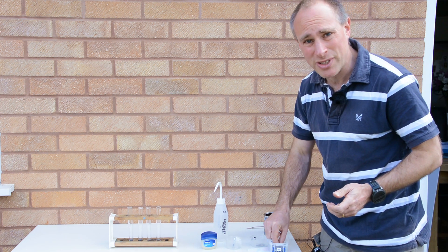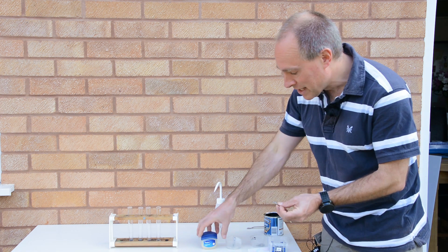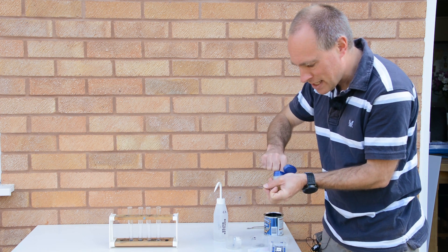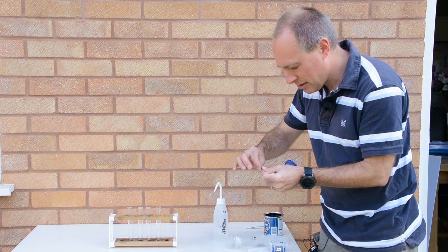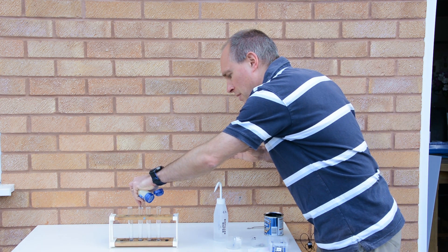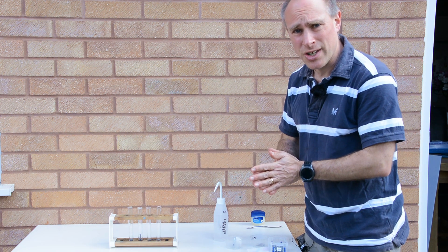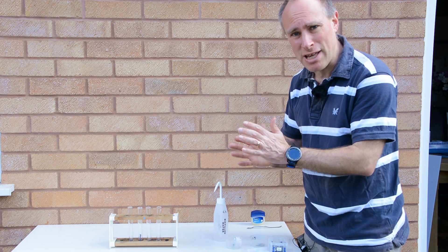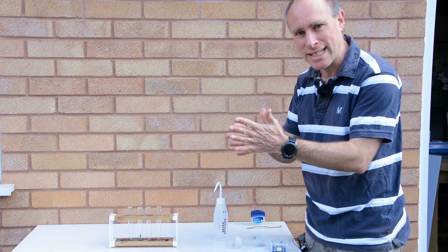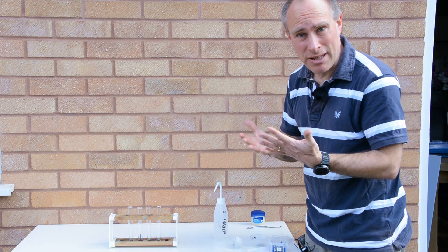The second method I'm going to look at is just coating the nails in some Vaseline, and I'm going to pop them into a test tube. Both of the methods used so far use a barrier method — the paint provides a barrier to stop the water and oxygen getting to the nail, and the grease does a similar job.